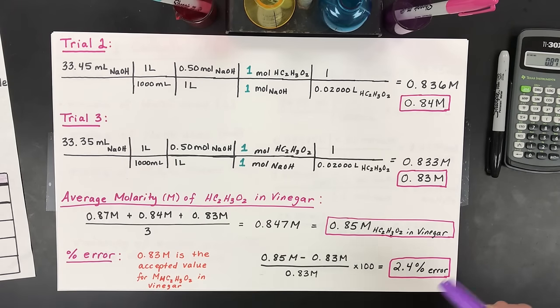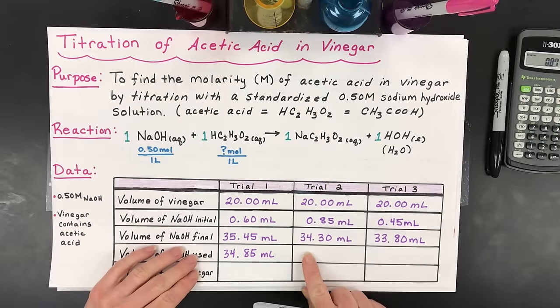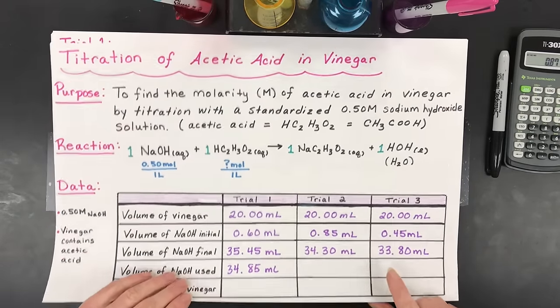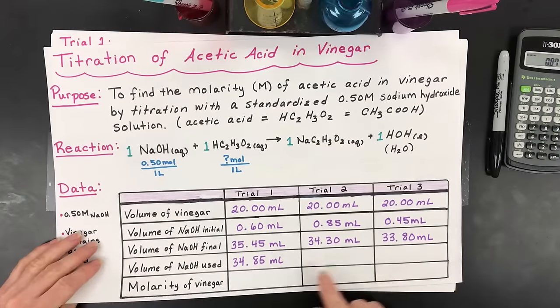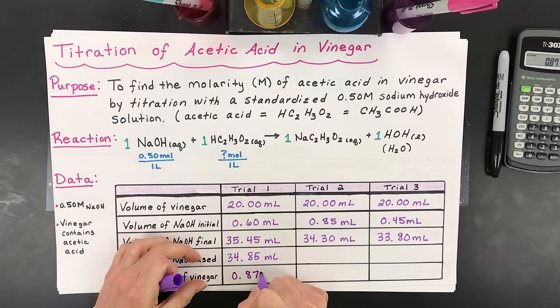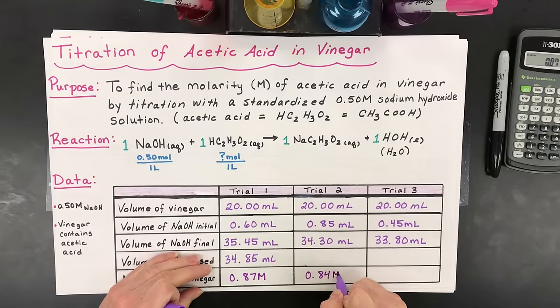A couple more things though, you might want to rewrite those back in your data table. So you may go back and put in your volumes in here. So 33.45, what was the other one? 33.35, and then put your molarities down here. So for example, like I had 0.87 molar, and then my second run I had 0.84 molar, and so forth, okay?